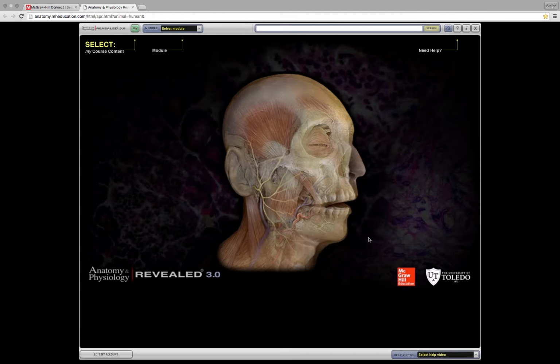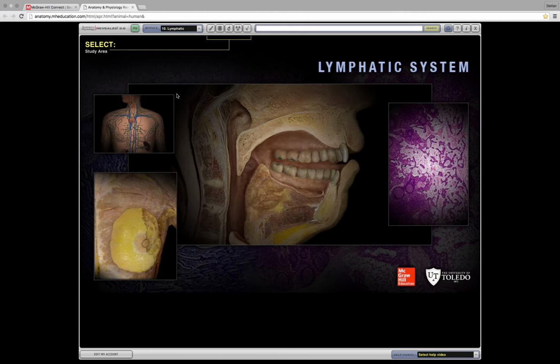The only reason I'm creating this video is because we had lab earlier this week and we learned about the lymphatic system. So if you take out your lab manual and turn to page 84, I'm going to run through the spleen, the lymph nodes, and the ileum of the small intestine.